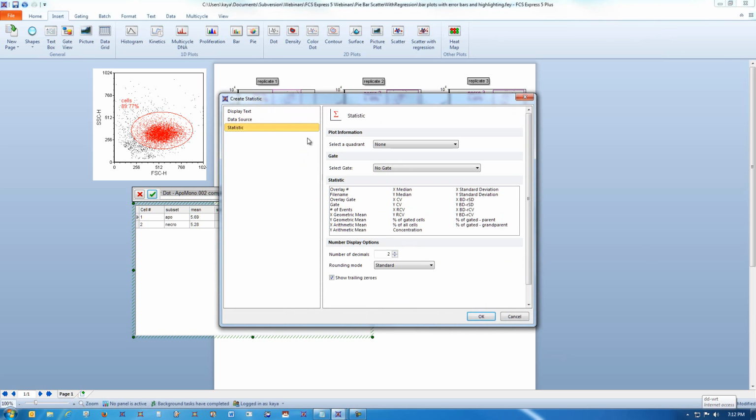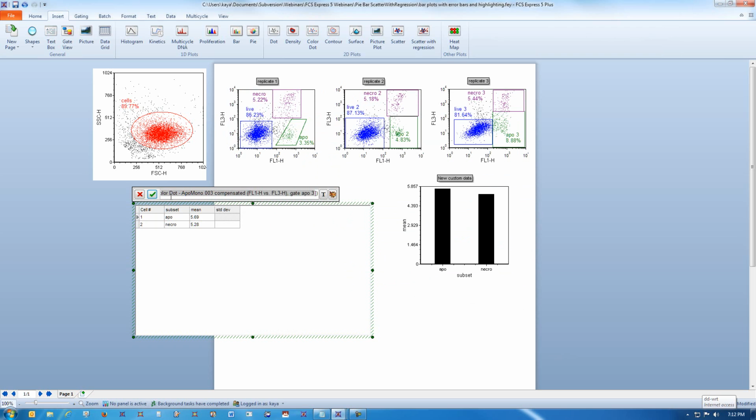So I'm choosing the third replicate. There we go. Oh, looks like I may have lost a parenthesis. Here, let's just take a look at the formula. Okay, we were just missing a comma there. So just make sure you don't delete any of those commas. Okay, so there it has updated: 2.86 is the standard deviation for the green gate between the 3 replicates.